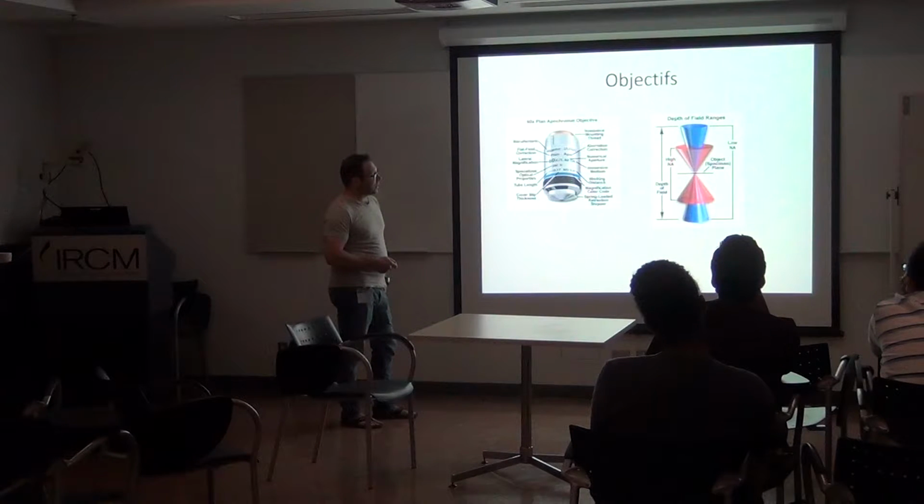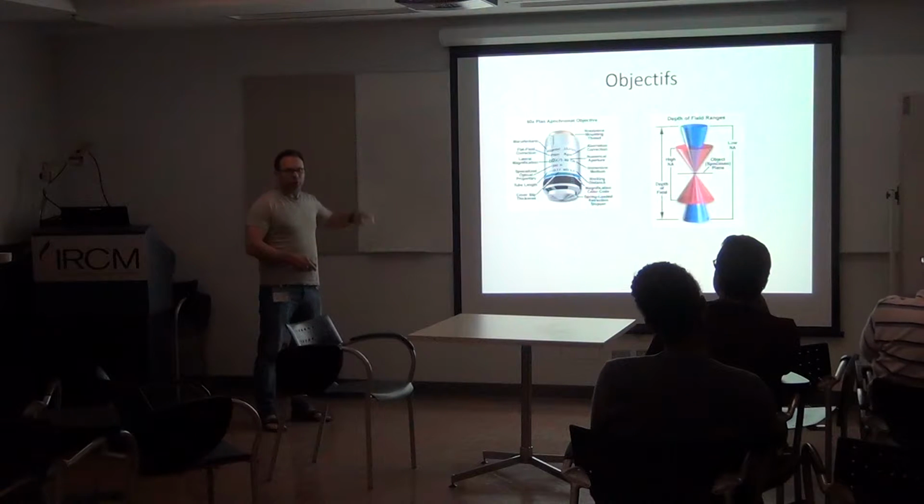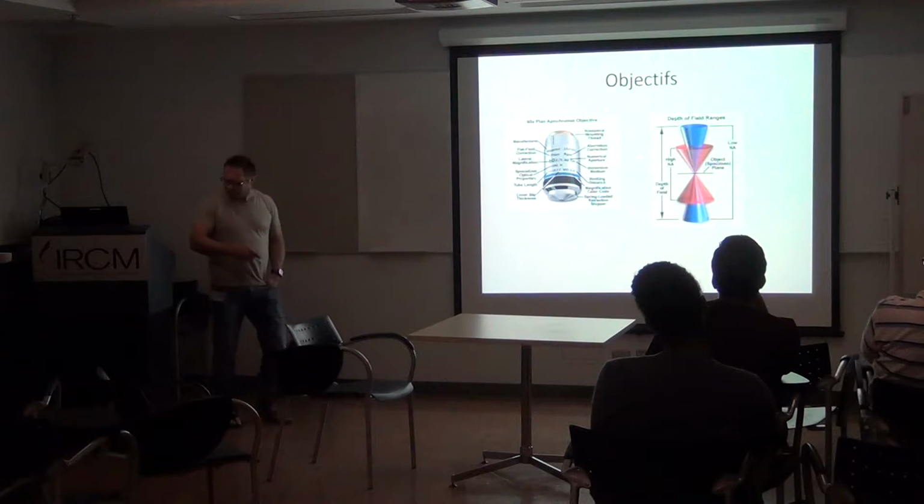Then with this high numerical aperture, rays are gonna, it will look really fuzzy. While with this aperture, it will still be kind of in focus. Okay? Because the depth of focus is the range in which things look at the right focus.